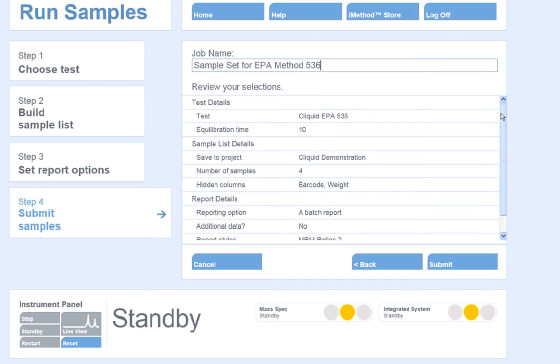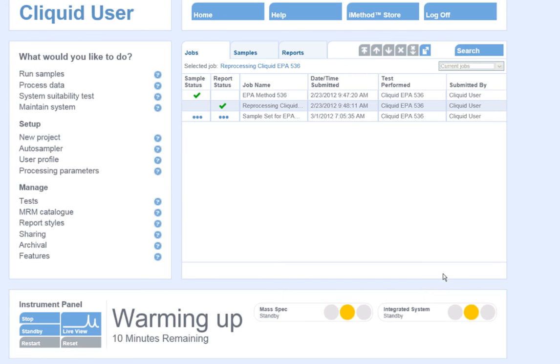Now I will hit Submit to submit my samples, and the instrument will go from standby to equilibration mode.